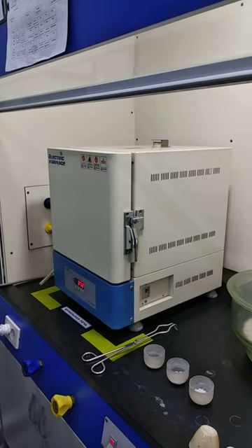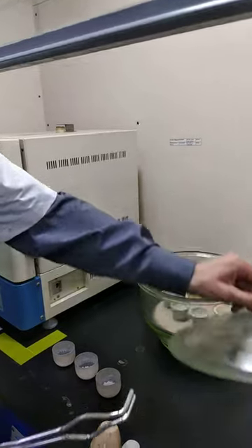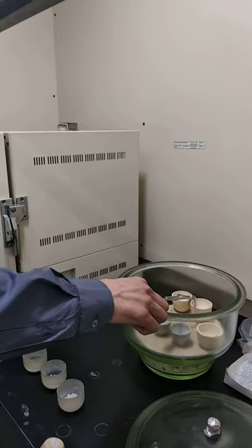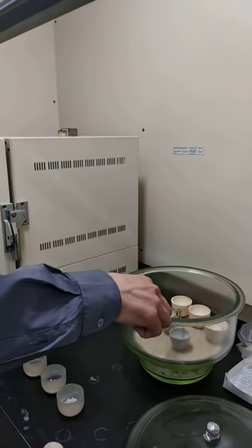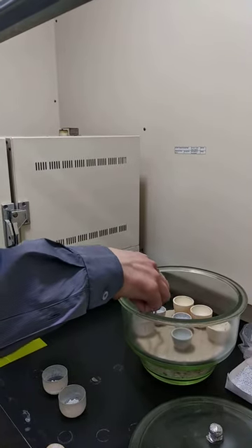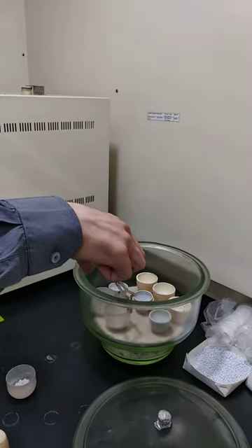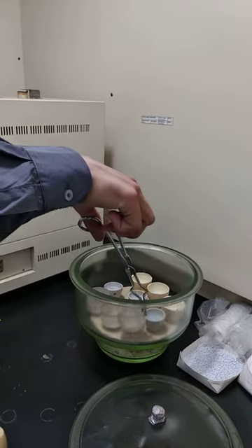Now we go to the desiccator — inside of the XC cutters. We should exactly know which one was the first, second, and third sample in order to subtract from the beginning weight of each sample.